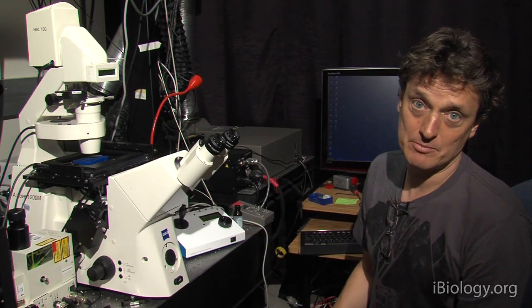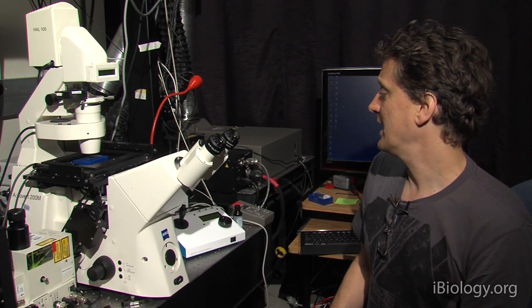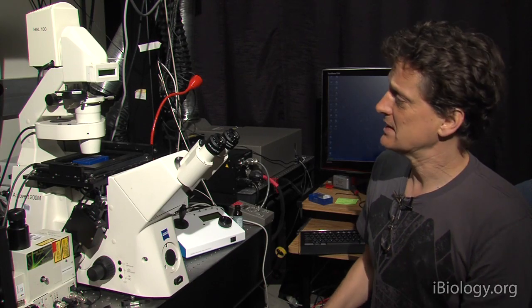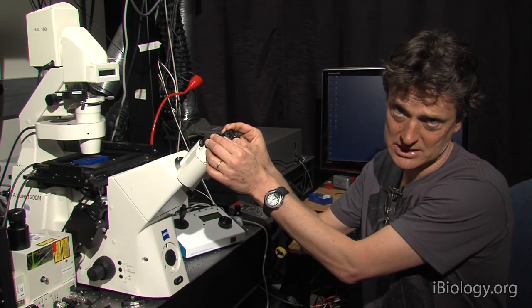We would have the ability to move the camera back and forth so that we can focus the camera directly. But in reality, that is almost never the case. And the only way to now correct for this is to use the eyepiece focusing.